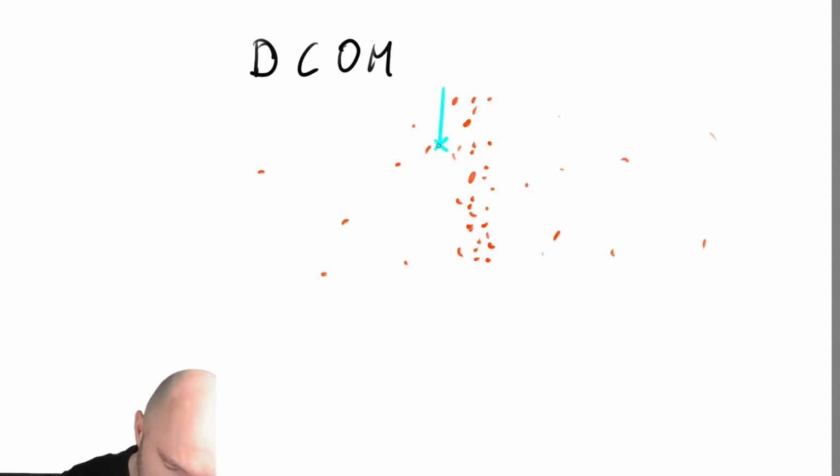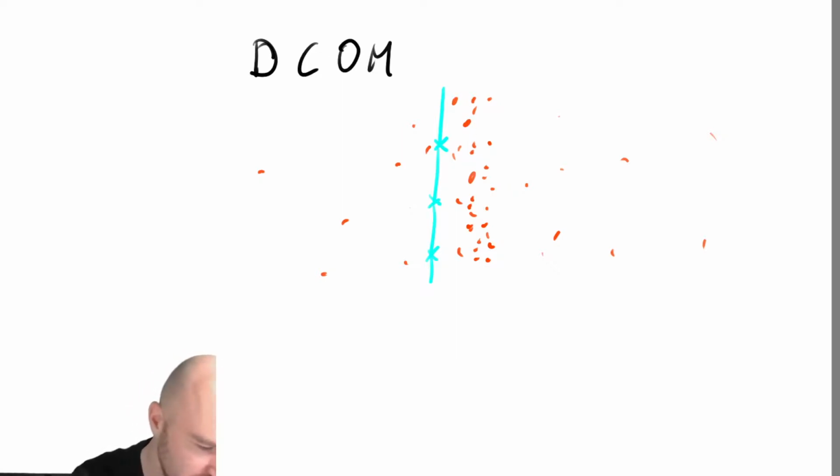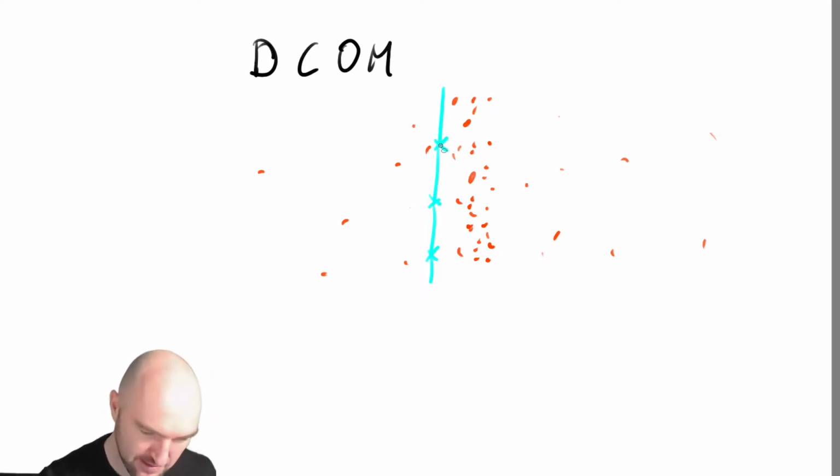So this might be our grain boundary, obviously just a 2D approximation. We've modeled it, and we've modeled it kind of alright, but not perfect. What we can do is actually we can move the vertices to the center, to the barycenter, to the center of mass of. And why can I? Let's try. Can I? No.